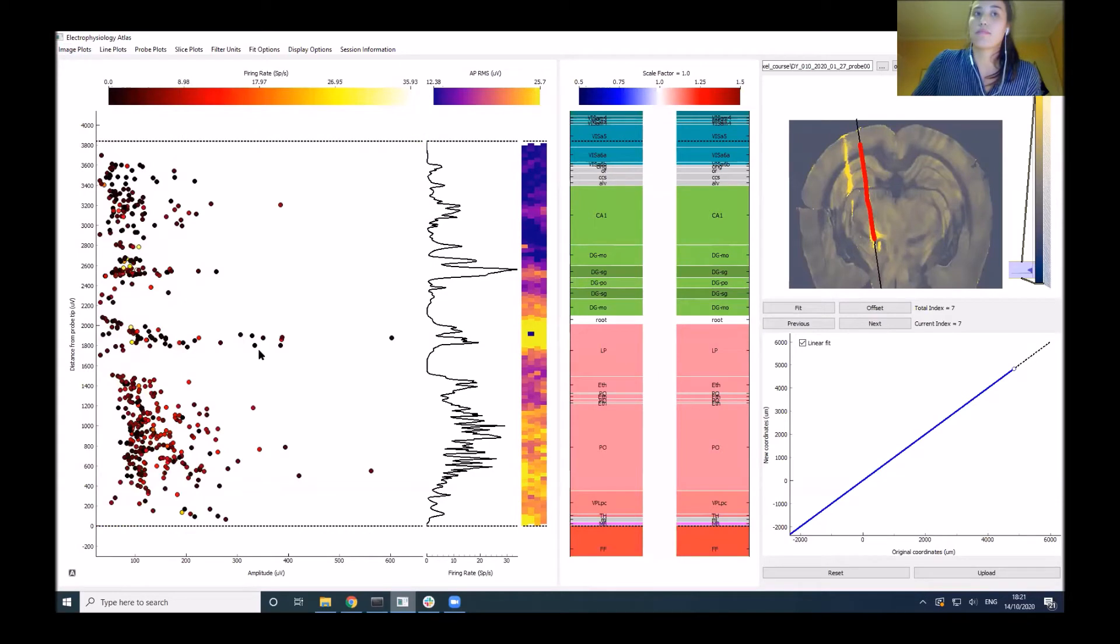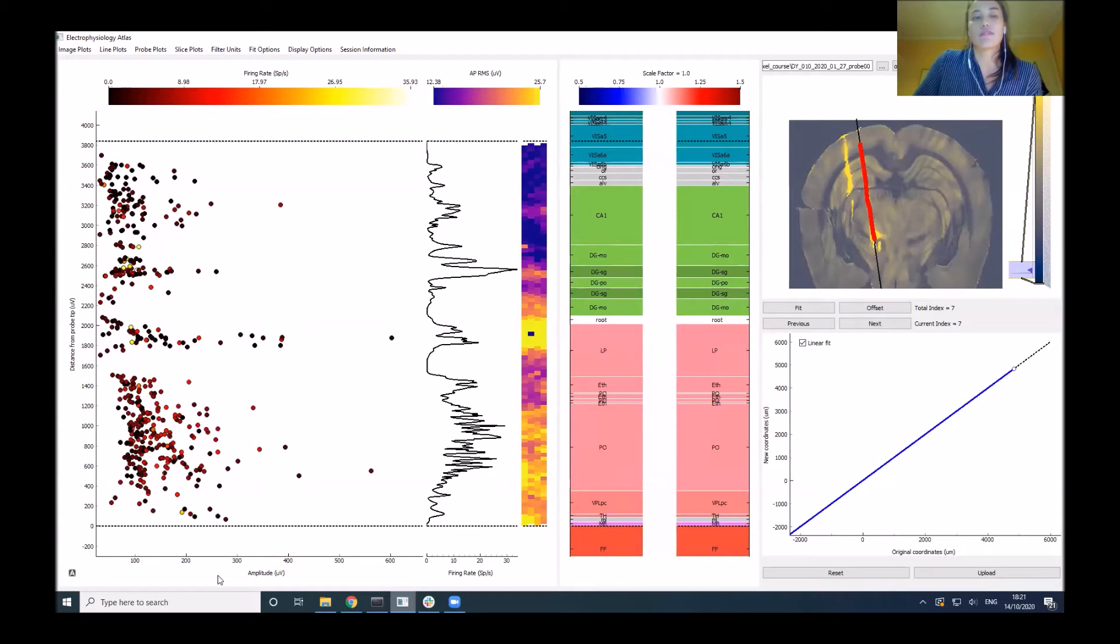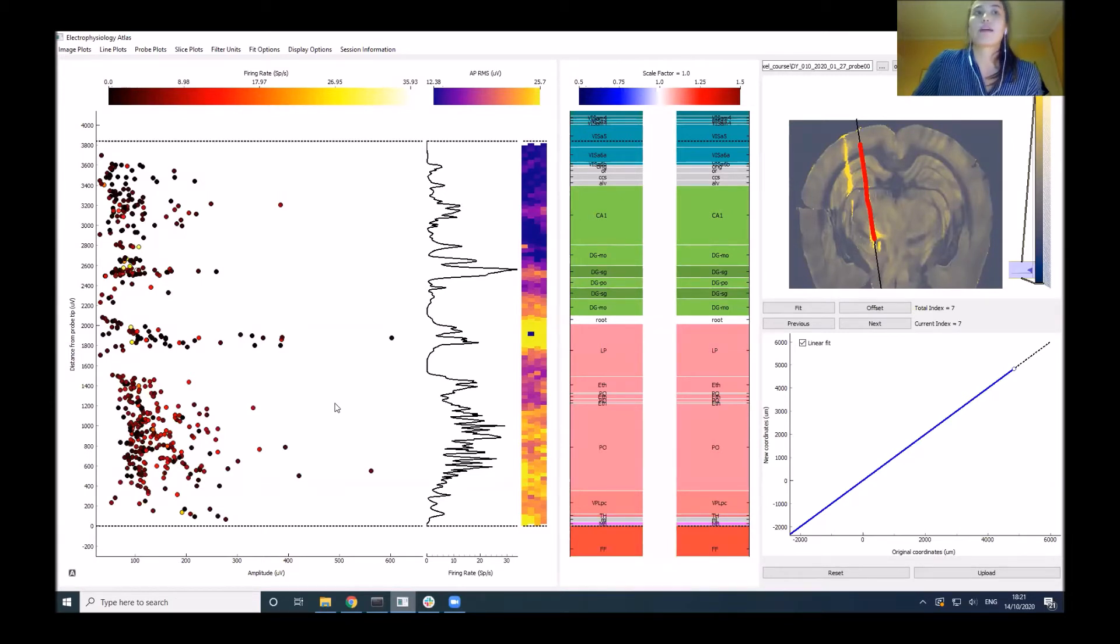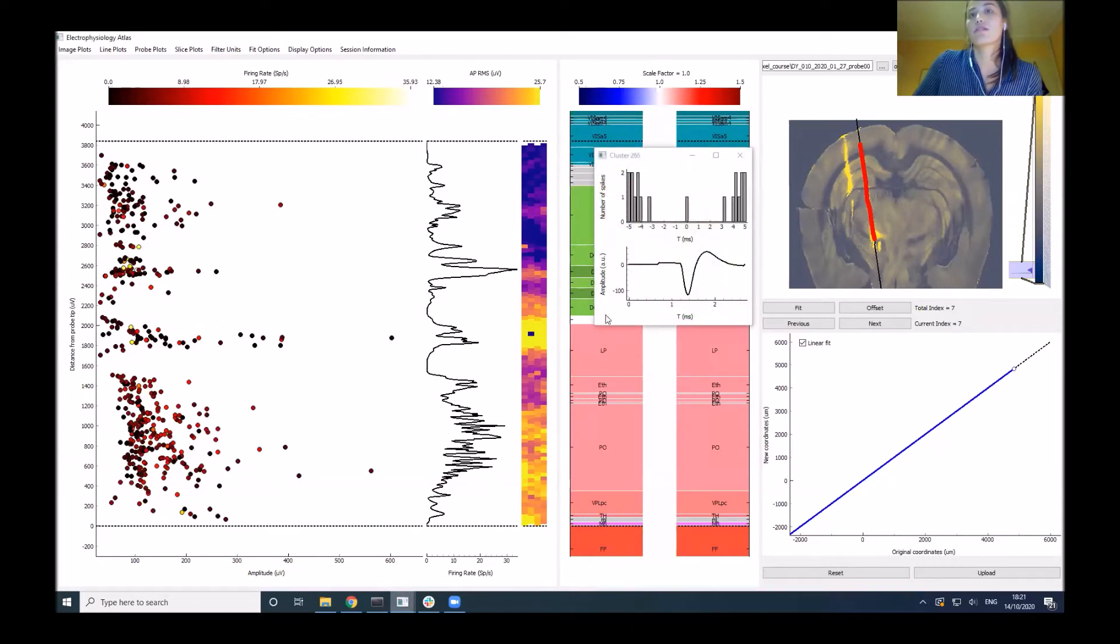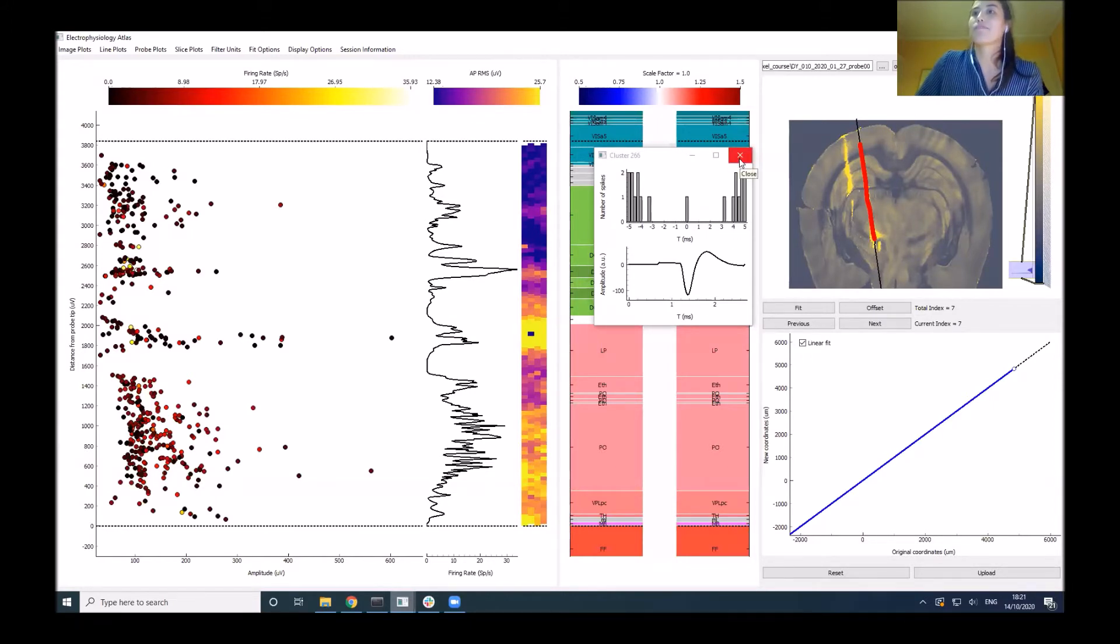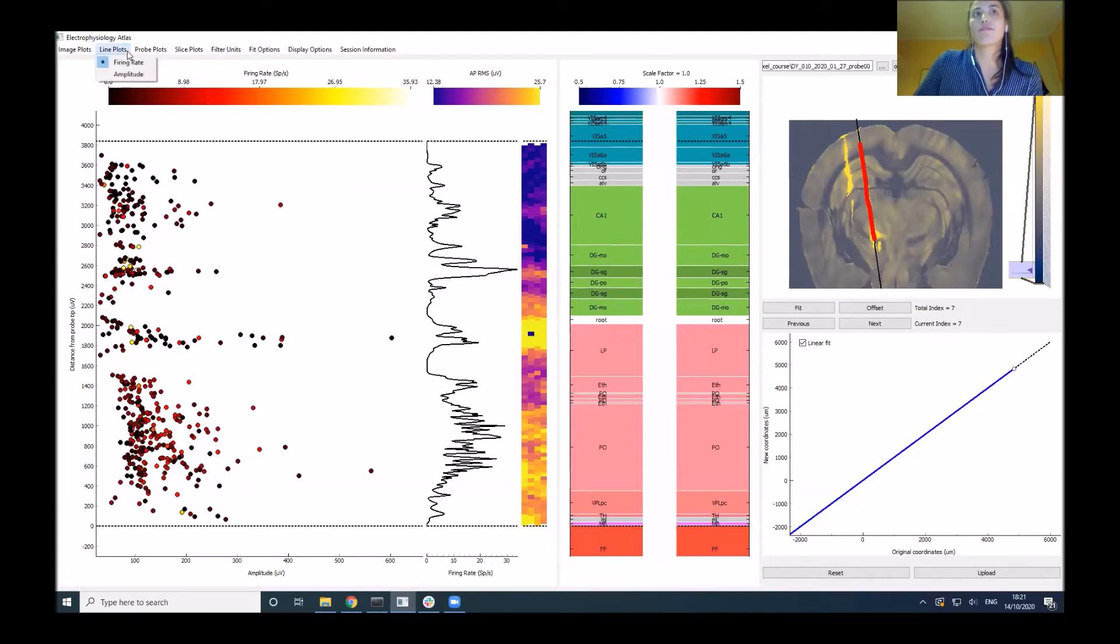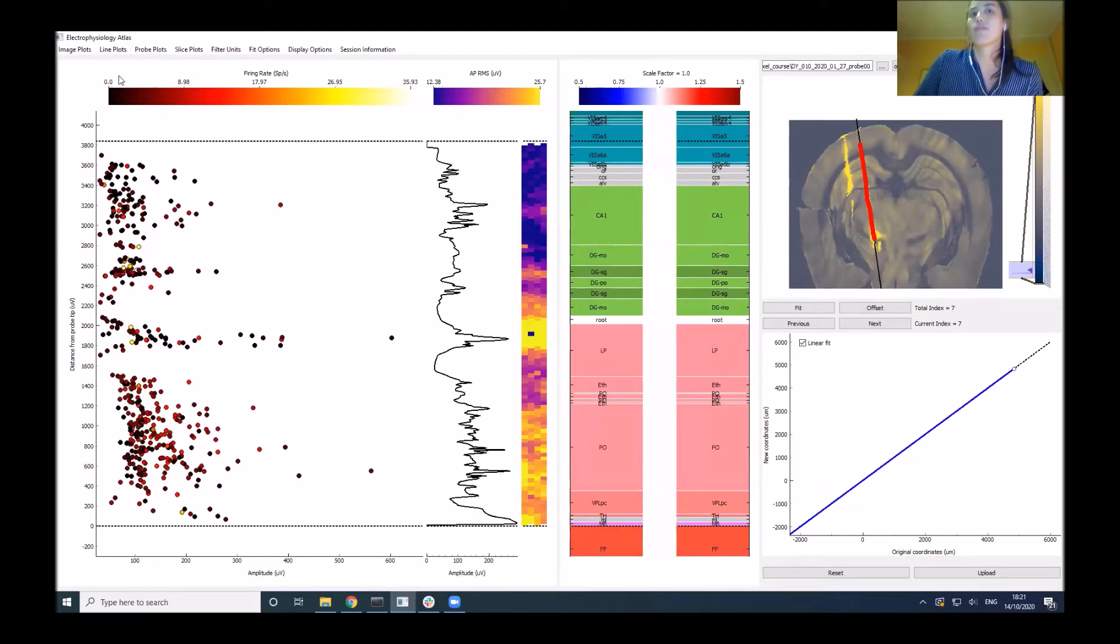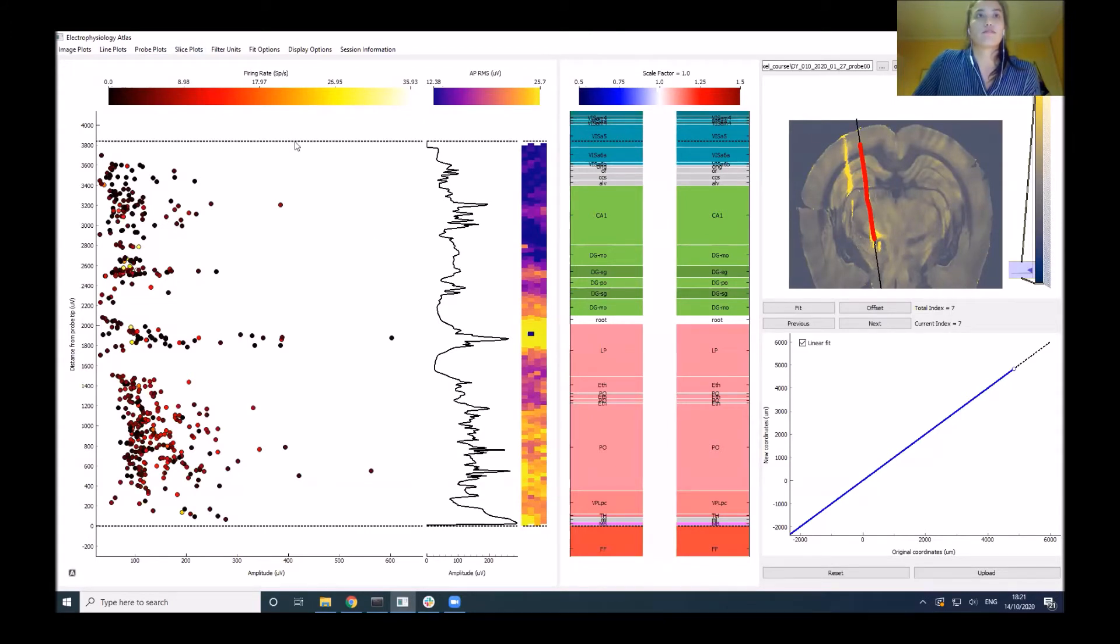You also have the power spectrum between zero and 300 hertz. Then we have cluster plots that show the location of your neuron along the probe against amplitude, and the heat map shows the firing rate. You can click on individual clusters to see their autocorrelogram and their waveform. We also have line plots with options to see firing rate or amplitude averaged across recordings.